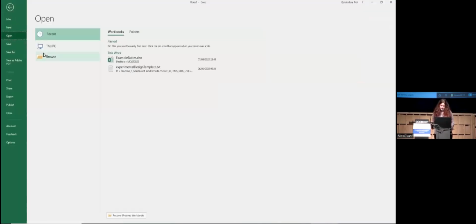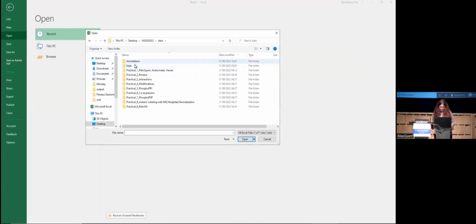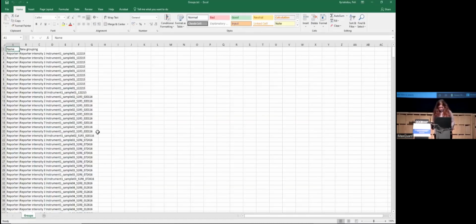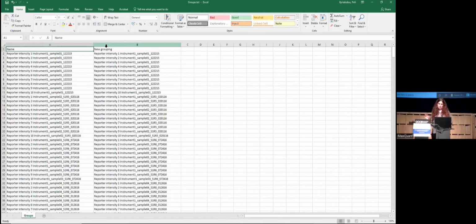And open the file that we generate. In my case, I put it under here: Output, not Excel file, all files, this one. So here you see already that there are two columns. Name is the name of your columns, and that one you don't have to touch. Otherwise, when Perseus will match, it will not recognize it, it will not add the annotation to that channel. So this one remains like this.